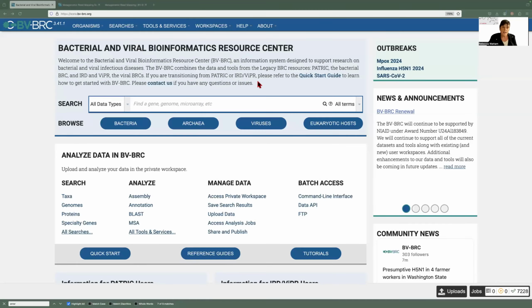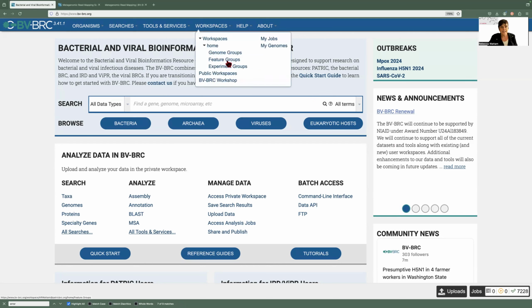Welcome back. In this particular video, we're going to start looking at the results from the metagenomic read mapping jobs. This will be in two parts, looking at the report and then the other things that are part of the job results. So let's go find our job.